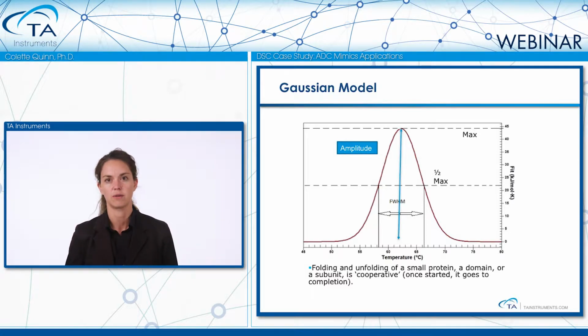And this is true of any kind of material sciences, that you want a very sharp unfolding peak. Well, the same idea could be applied here to the proteins. If you've got a very broad unfolding, we've lost some cooperativity, but really the idea is that we've got a protein in multiple forms. Definitely we're always going to have a protein in multiple forms because it's very dynamic in solution. But in here you've got multiple energy or degeneracy levels.